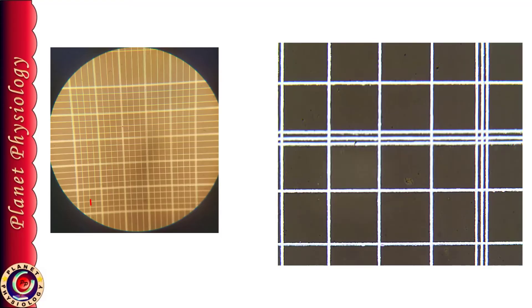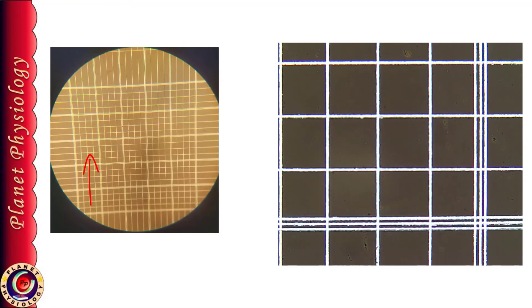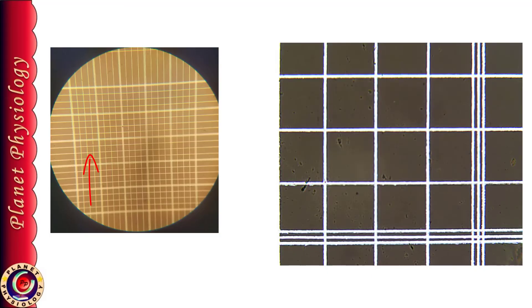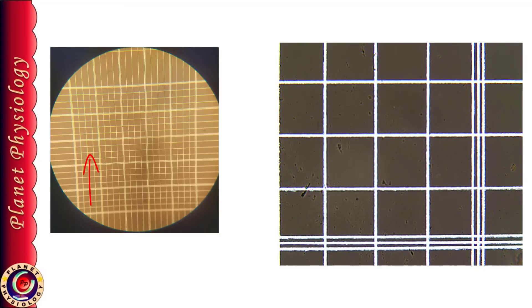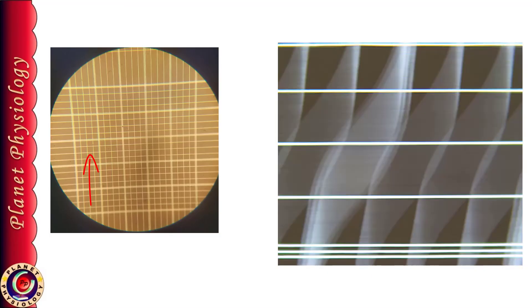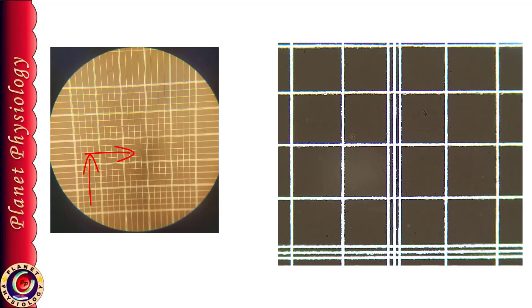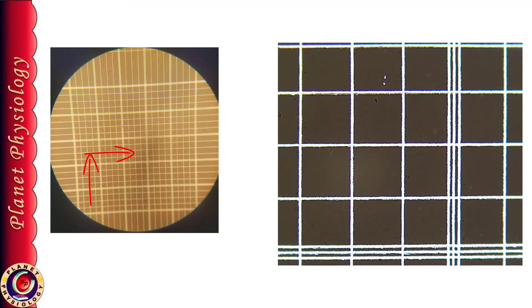To focus central RBC square, start with any one cornered RBC square. Move the stage by 2 medium size triple line bounded squares up. And then 2 similar medium size square towards right. Now you are in central RBC square.